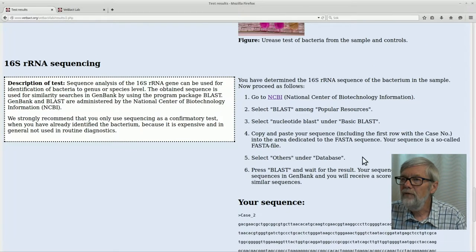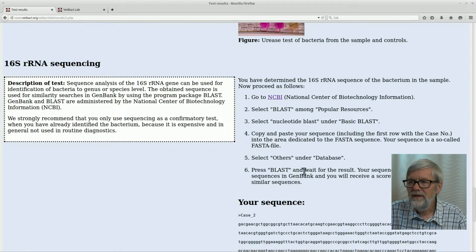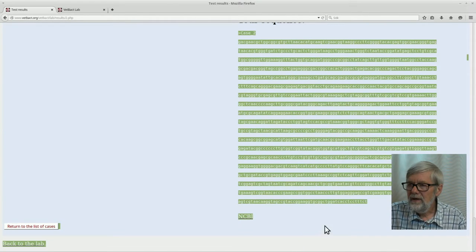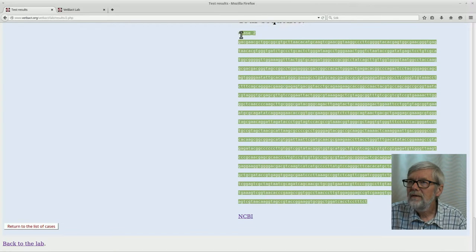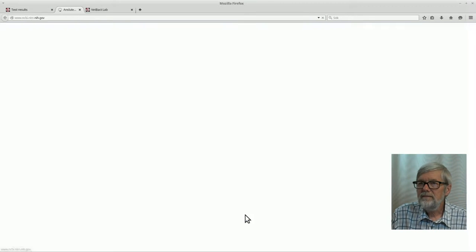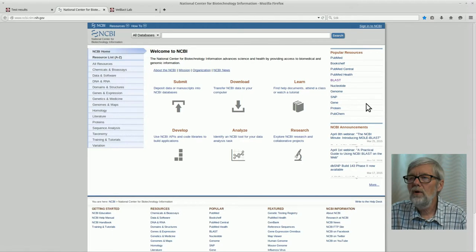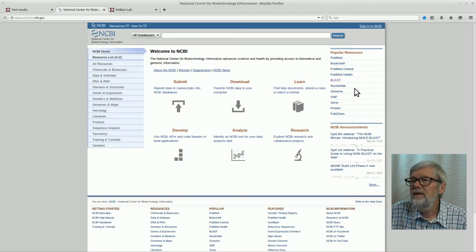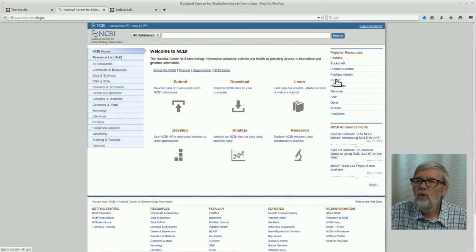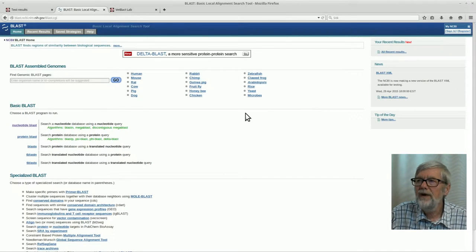Here you have information about how to proceed with the sequence. You should go to another website called the National Center of Biotechnology Information, NCBI. The first thing we do is copy the whole sequence, then go to NCBI. We are now connected to the database in the United States where GeneBank stores all sequences determined in the literature. We will use a program called BLAST, which compares your sequence with sequences in this database. We scroll down to nucleotide BLAST and select it.